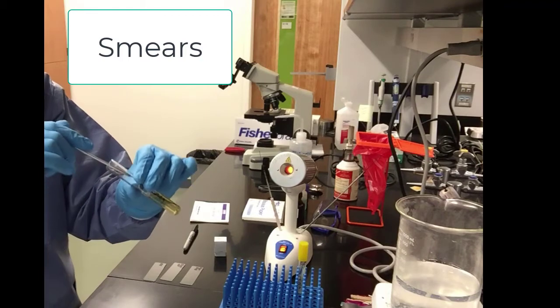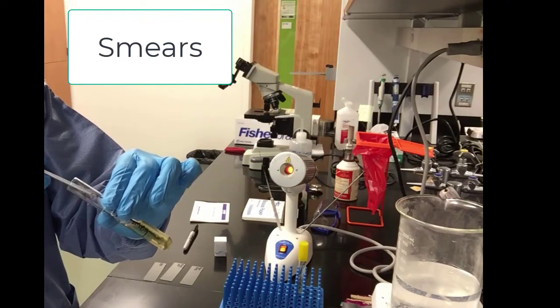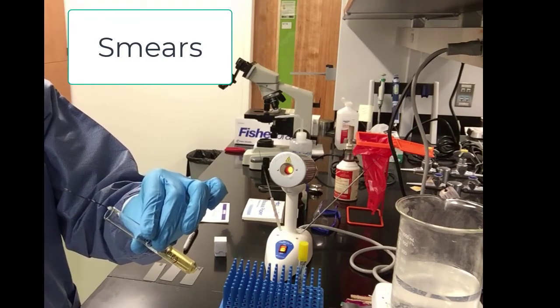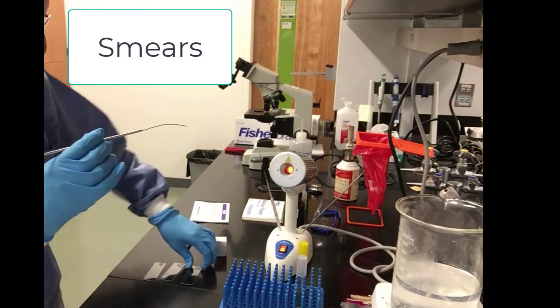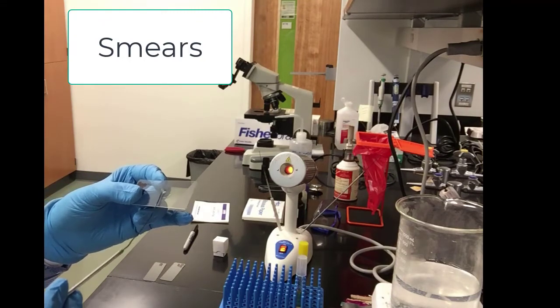We will prepare the smear by taking a sample from the bottom of the tube. We want a good sample of Mycobacterium smegmatis. And you can see it here. It's kind of clumpy a little bit. And Mycobacterium, by the way, does tend to clump on slides. So it's nice if we can spread it as well as we can in a quarter-sized smear.